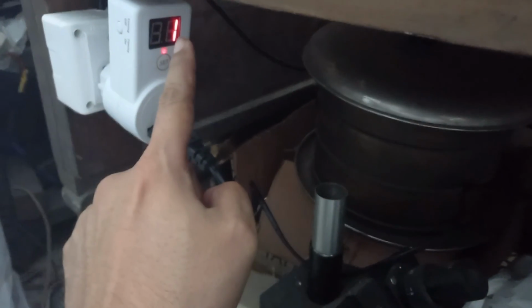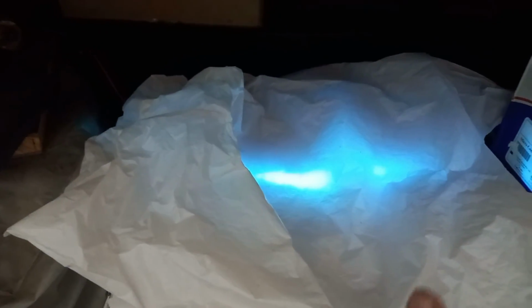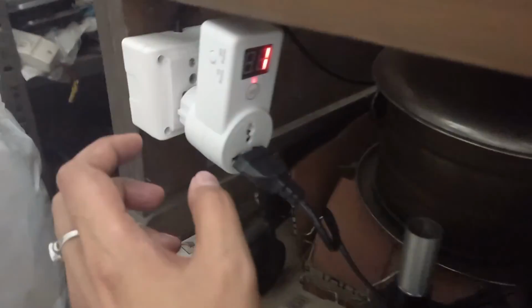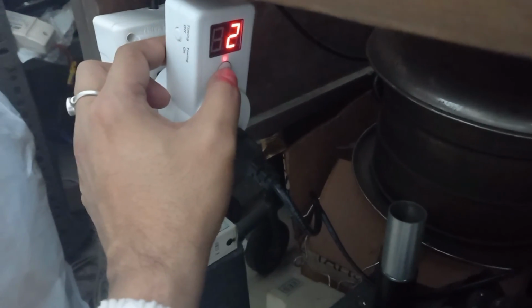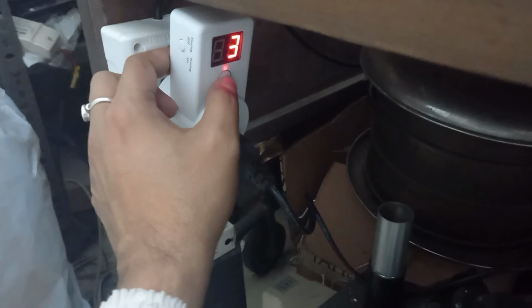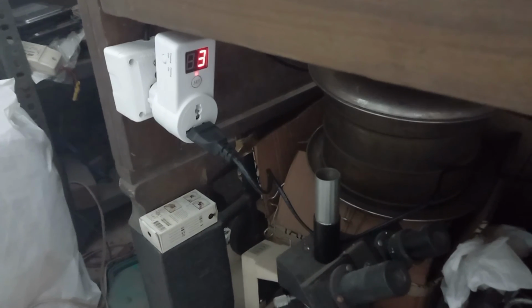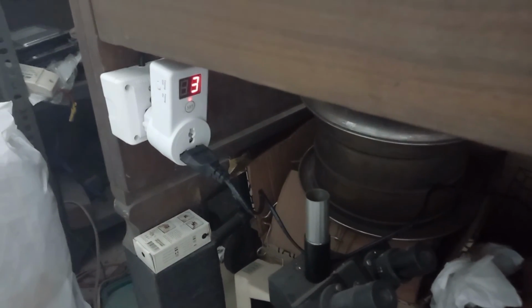This is just showing one, that means 10 minutes. The UV light of this cabinet will be switched off after 10 minutes. If you want to increase the timer, 1 to 2 will be 20 minutes, now this will be 30 minutes. Like that it will increase.